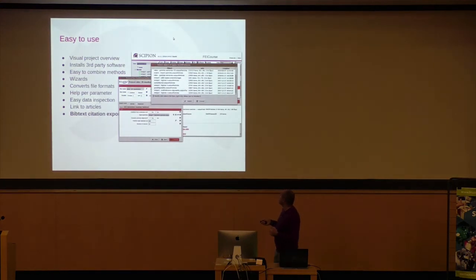So you click on the magnifier, you will get the list of candidates you can use in this protocol. And it doesn't matter if it's a Relion output or Scipion output or Xmipp output or whatever output. Those are a set of particles, and those can be used in Relion.